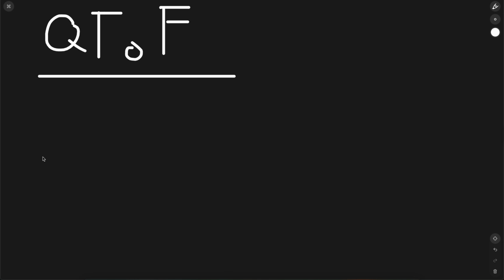Now let's talk about the other one that I wanted to discuss in this video, Q time of flight, or QTOF. Okay, so in this one, again, you have the ion source, but it's kind of like MALDI-TOF, where you can literally just hook up a MALDI-TOF. You do TOF instead of a quadrupole. So instead of physically selecting in space for those ions, you go for a time of flight method instead. Then you go to the collision cell.